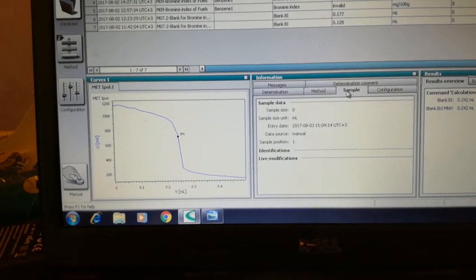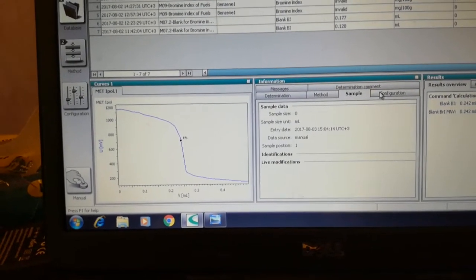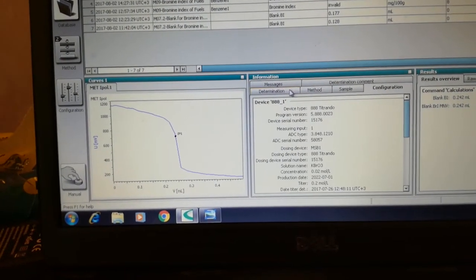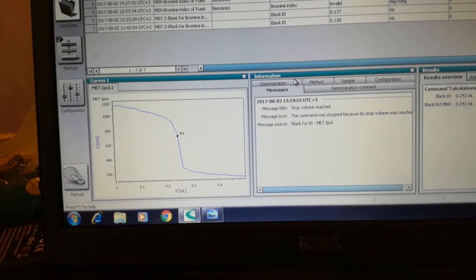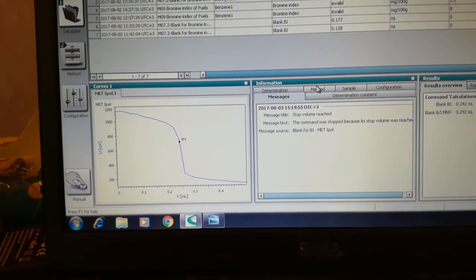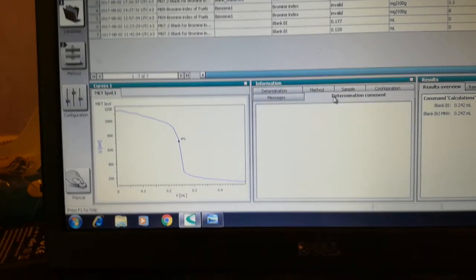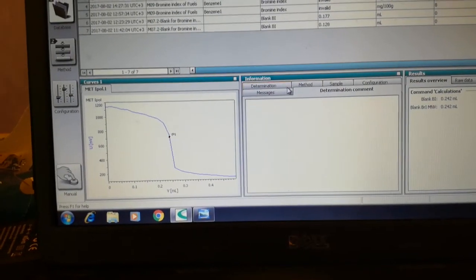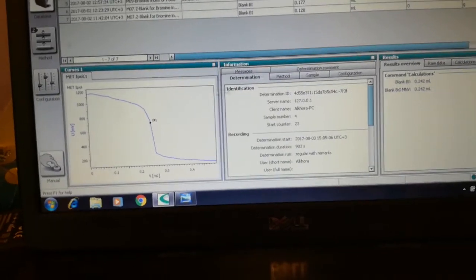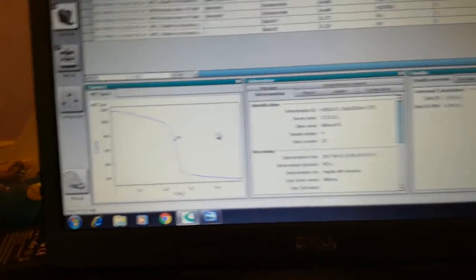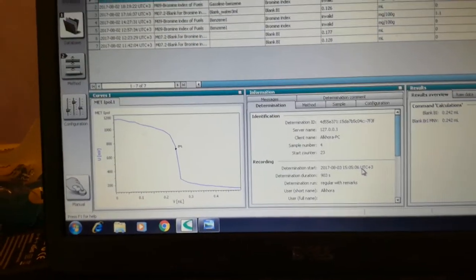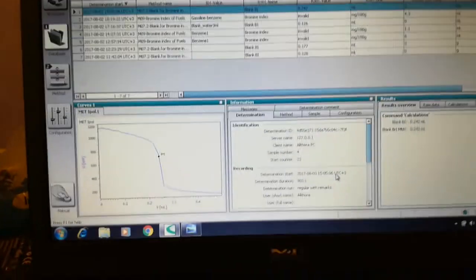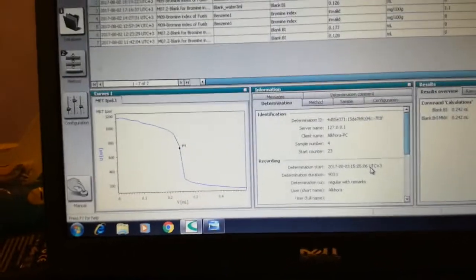You can see now these are the details of the blank test: the method, sample configuration, messages, termination comments, and the graph.